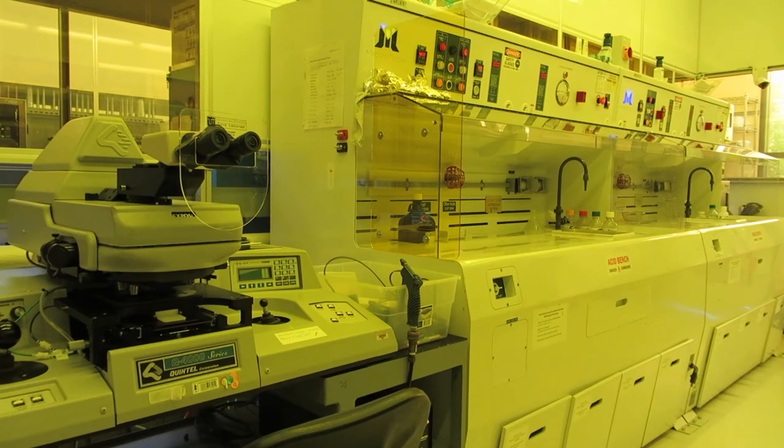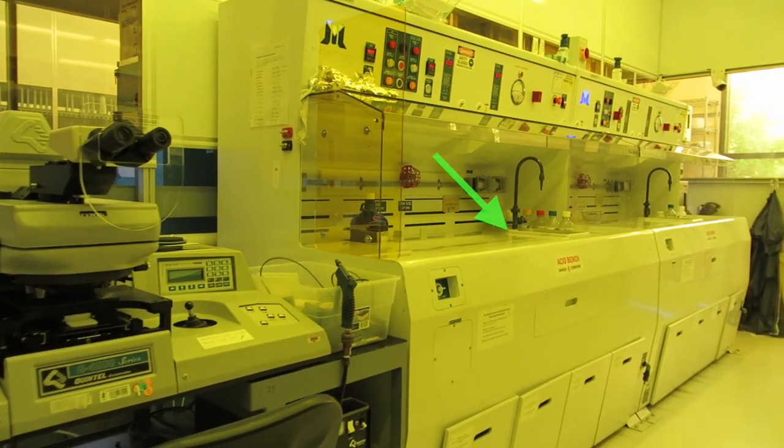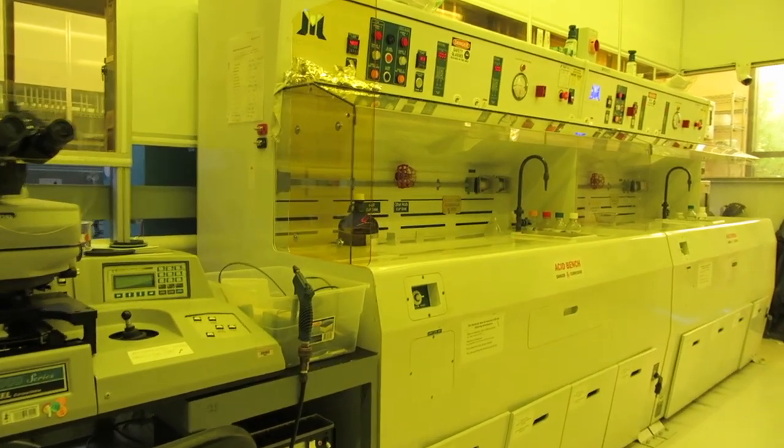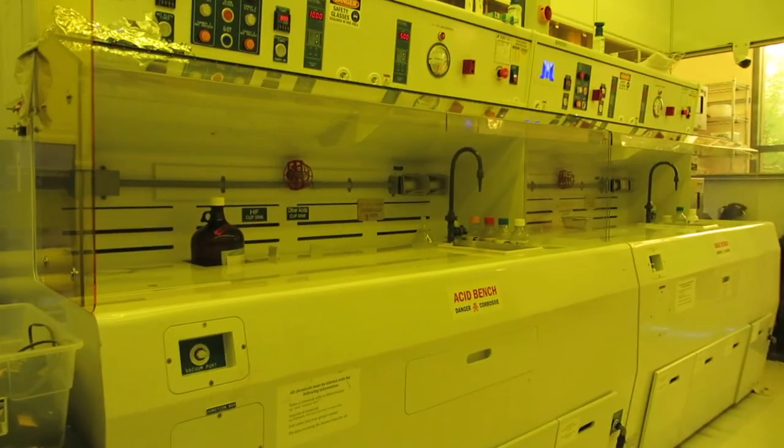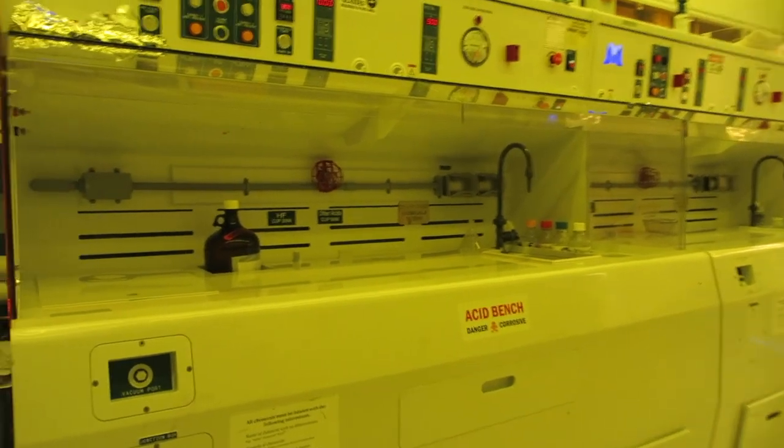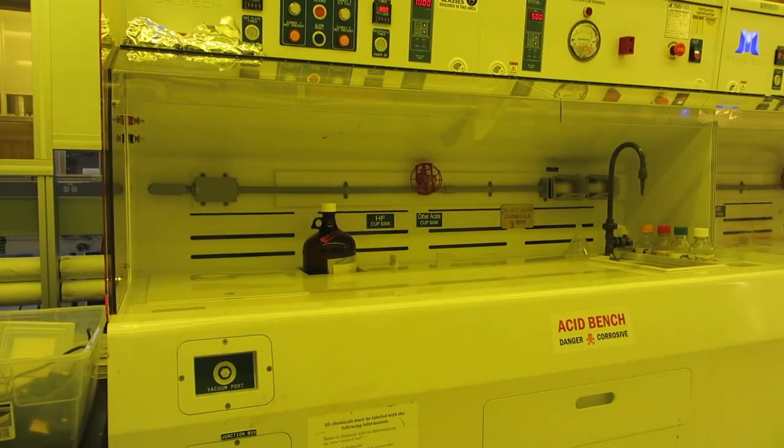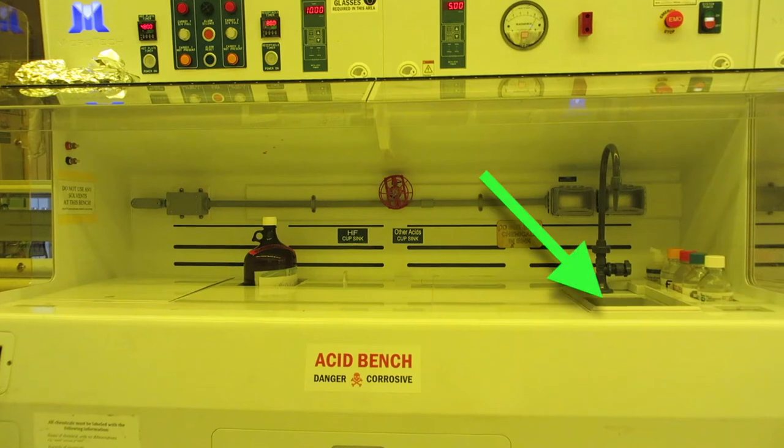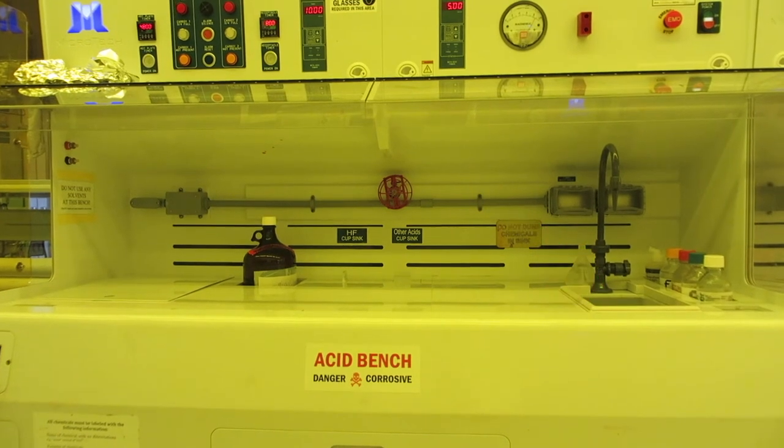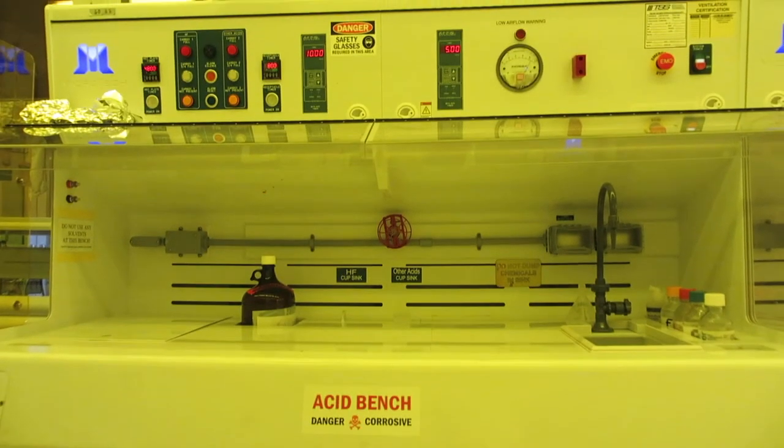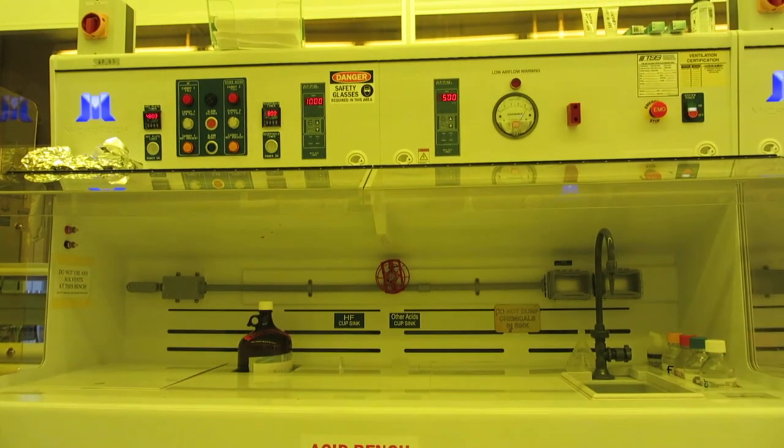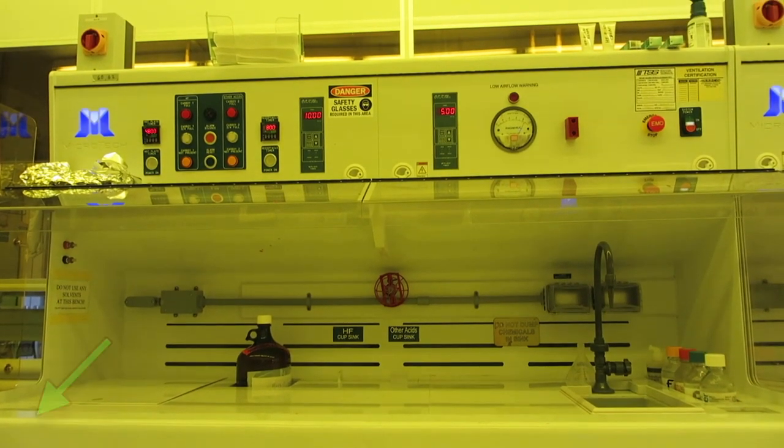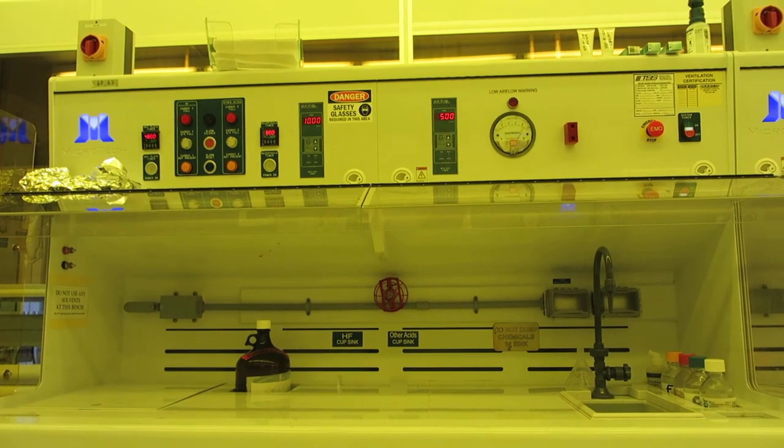Now we'll move on to the acid bench. This sink and the other two sinks in this room provide 18 megaohm deionized water. Only non-corrosive non-toxic things such as water or dilute detergent should go down the drains in these sinks. There are also DI water guns located in sunken wells near each sink in this room. And there are nitrogen guns at both ends of every wet bench in this room.